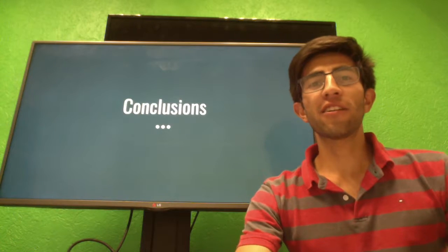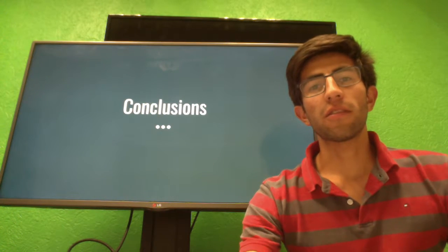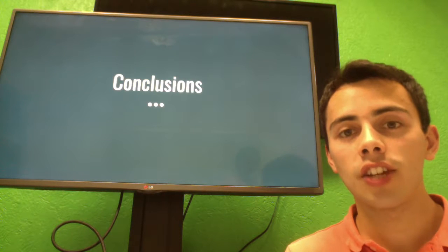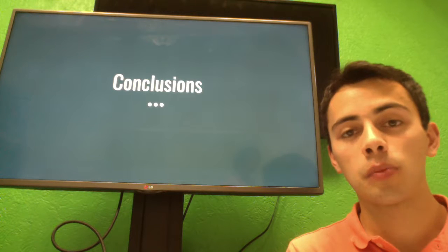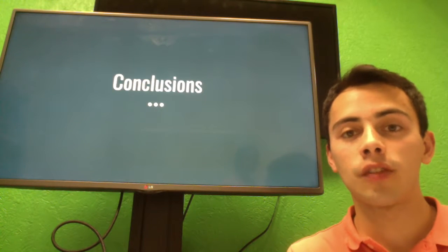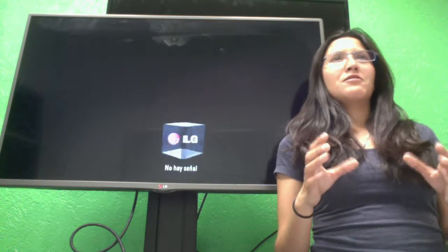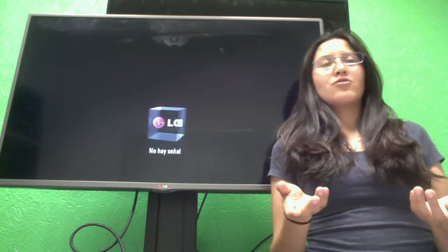In this practice, I learned how tempering heat treatment should be done, and how a heat treatment can change the properties in the steel's life. Throughout this practice, I learned the process of carburization and the different steps that need to be taken in order to do this process. I also learned how, according to the different heat treatments, the mechanical properties of the steels will change. With this practice, I learned that it is very important to do the quench, because the results are very different when you do quench between each treatment and when you don't.